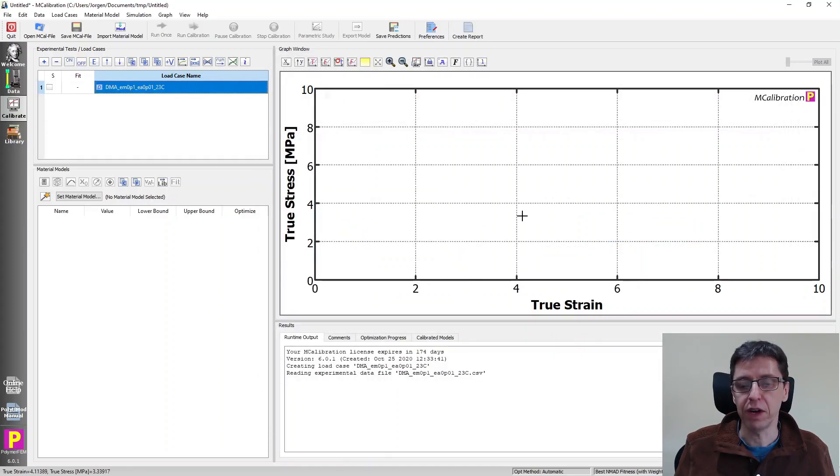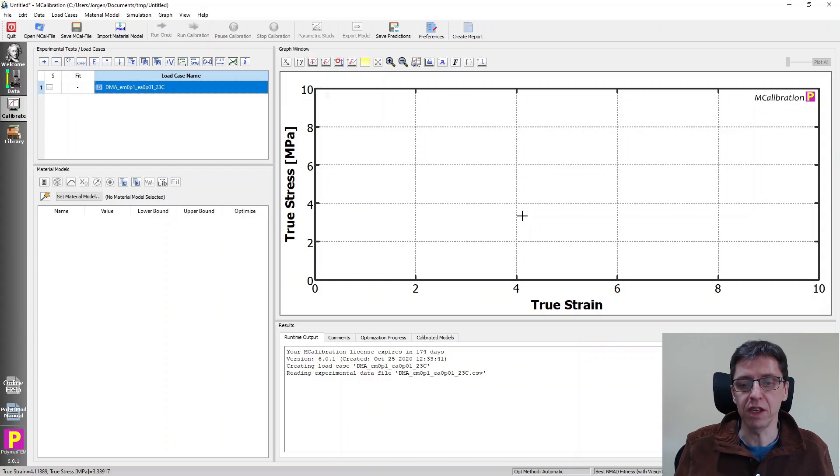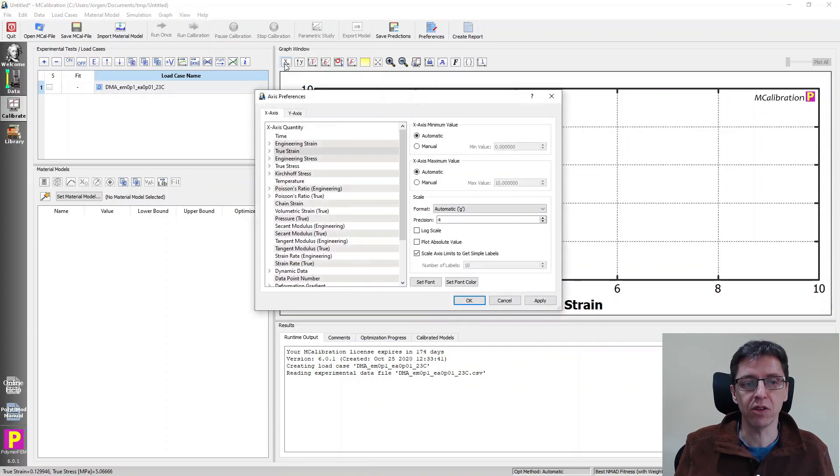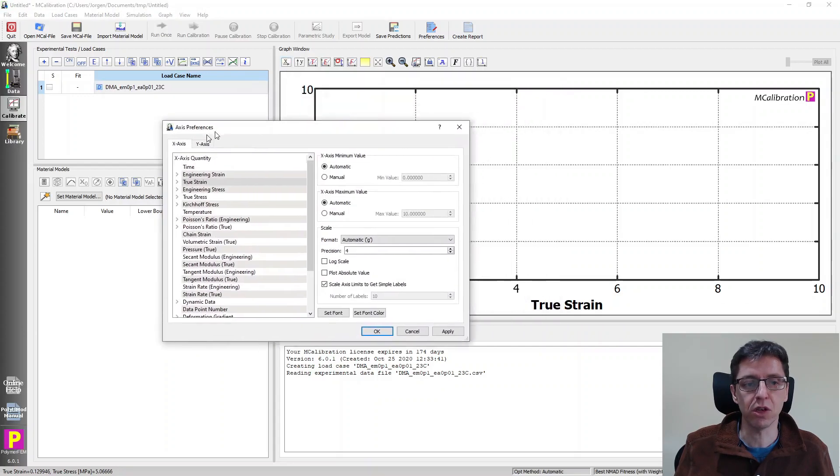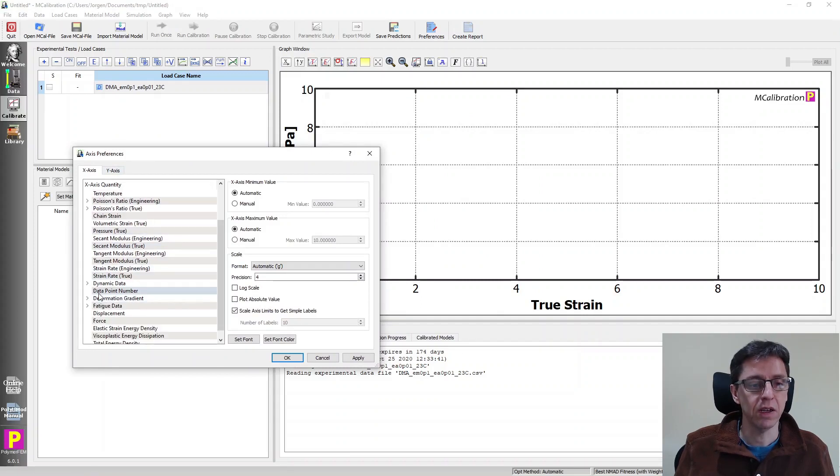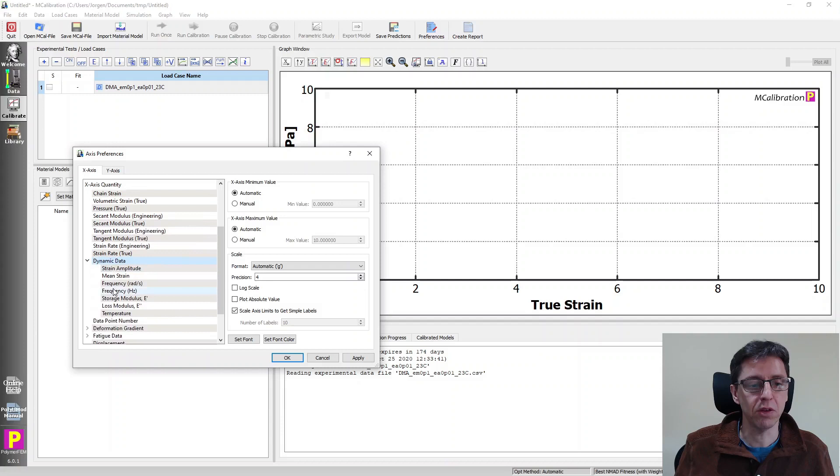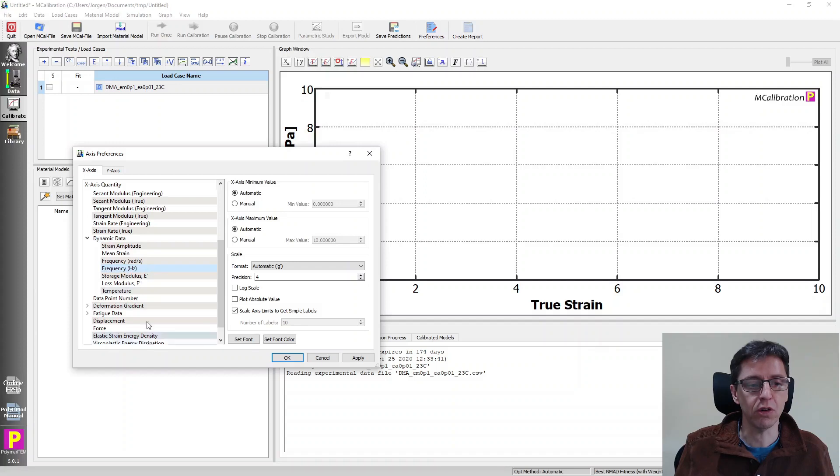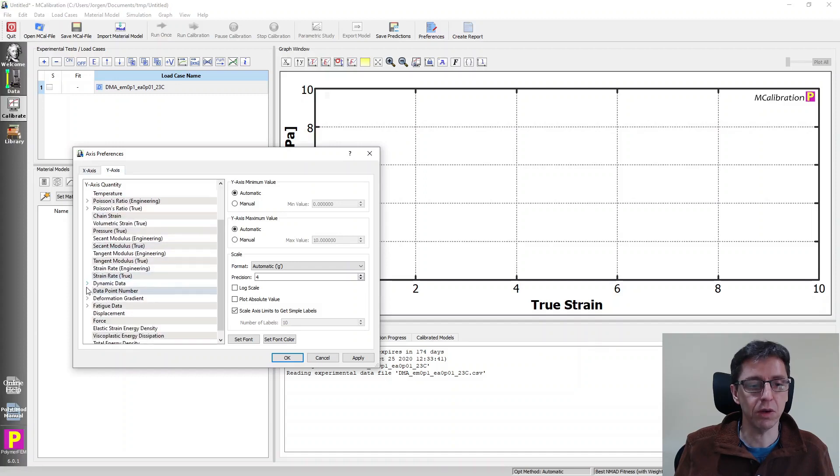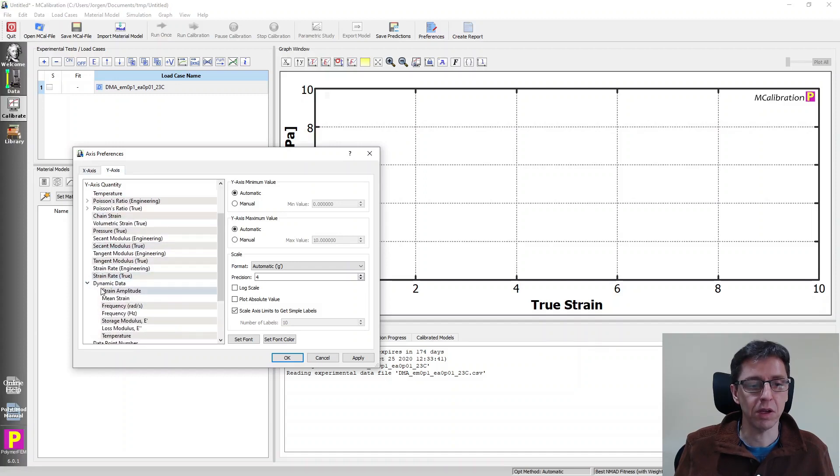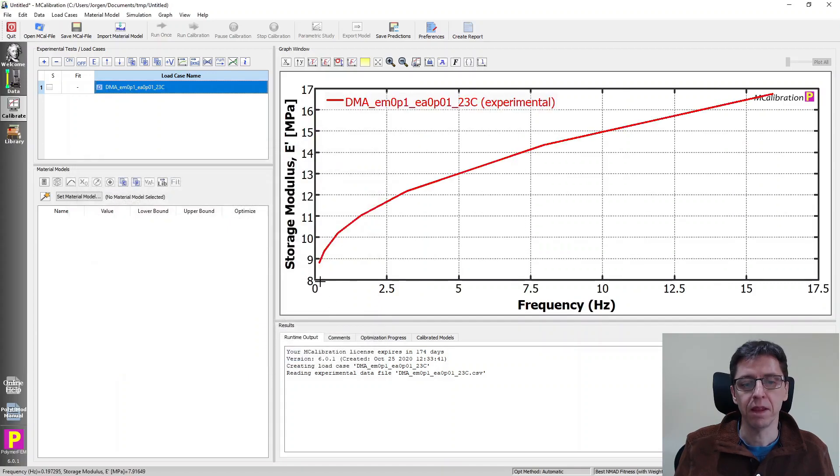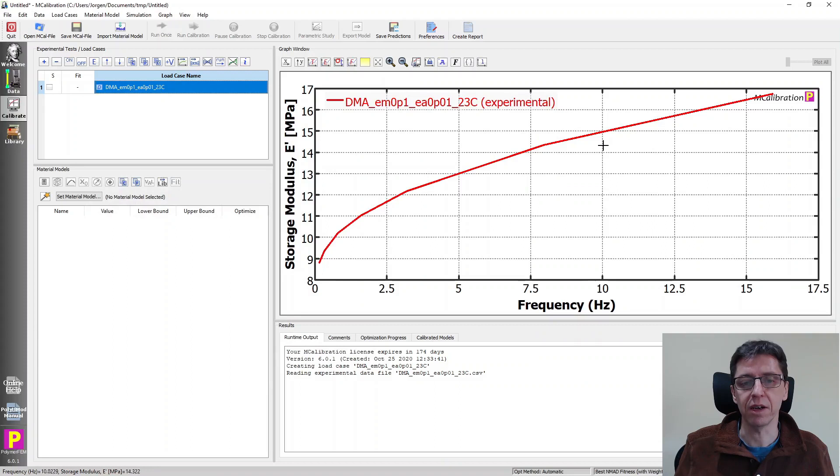But when you look at the graph, we see no data, there's nothing here. So we need to change the graph, the plot, in order to see the dynamic data. So I'm going to click on the x-axis to switch the type of data that's plotted. I'm going to go down to dynamic data and open up the sub menu here and say on the x-axis, I want to plot frequency in hertz. On the y-axis, I want to plot dynamic data storage modulus. And I say okay. Now we can see the experimental data here.